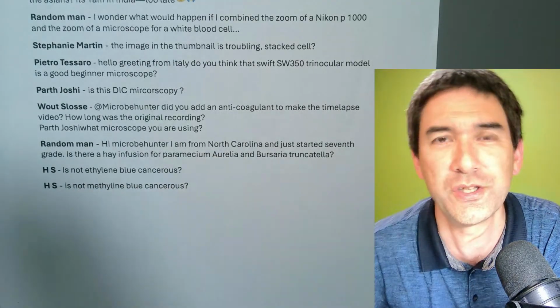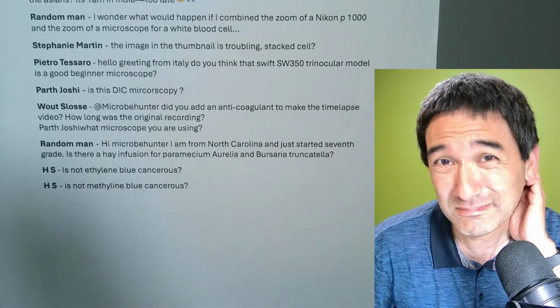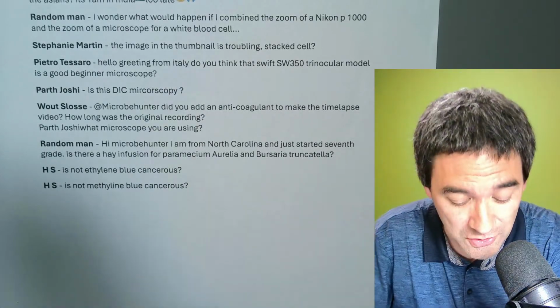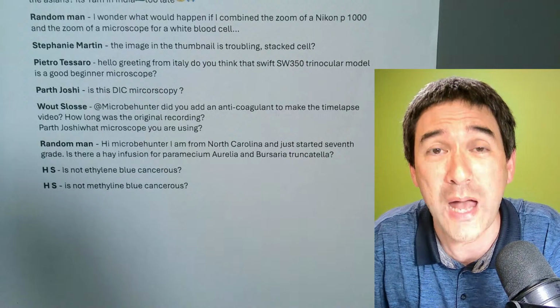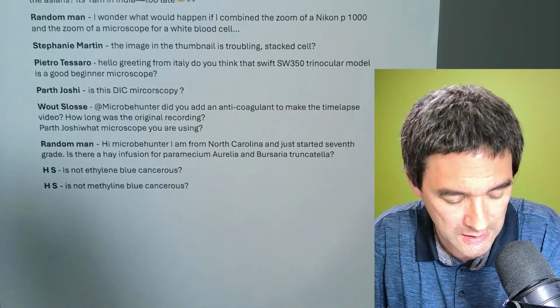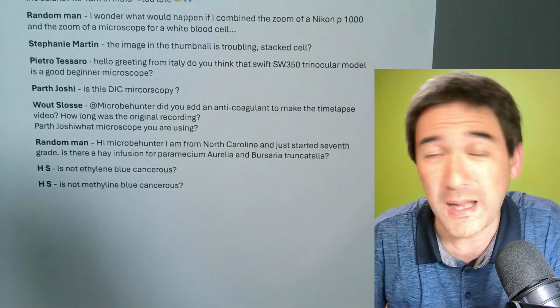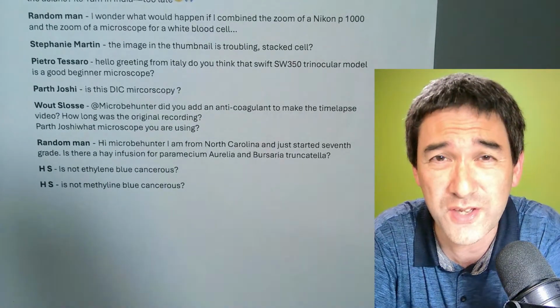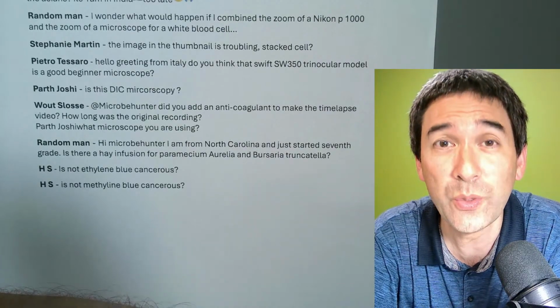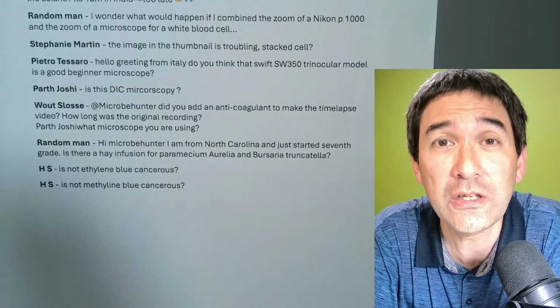Okay, hay infusions, big topic. Not so happy. So that is the thing that I would like to explain to you. What is a hay infusion and why am I not so happy with a hay infusion? And I'm going to give you a better tip. Generally, hay infusions have been used back in the day, 19th century maybe. What they did is they took dry grass, which is hay, added water, and then let it stand.